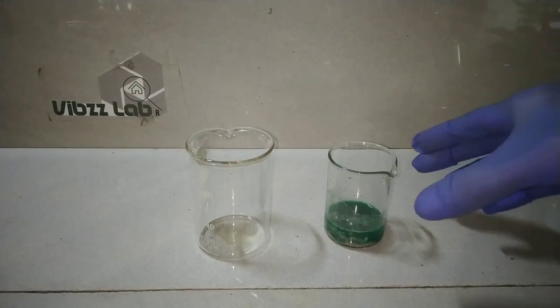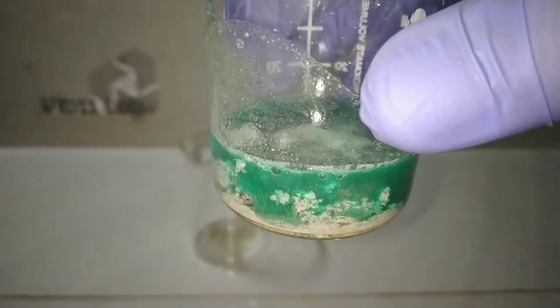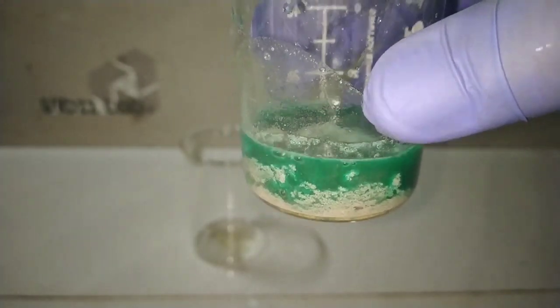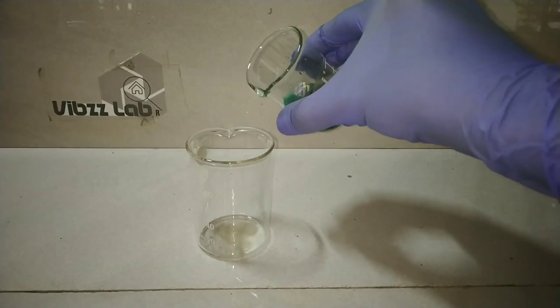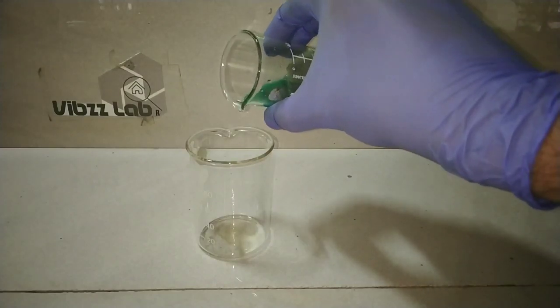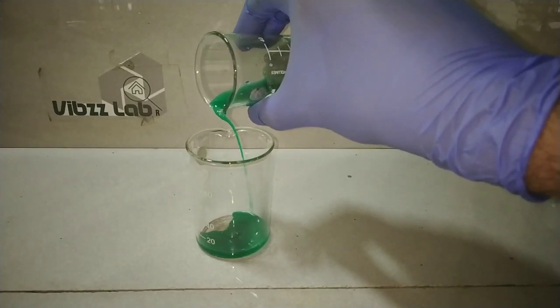I kept the solution for about 1 hour and when I checked, I found that most of the silver metal has precipitated out. Now I will decant the supernatant solution containing mostly copper nitrate and then wash my silver precipitate a couple of times with deionized water.